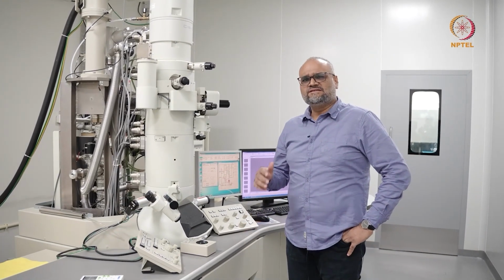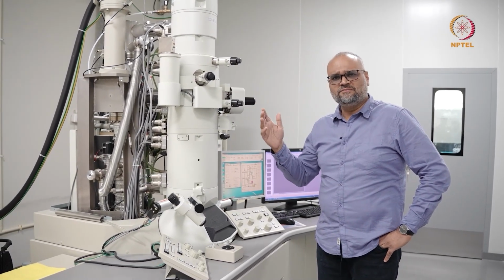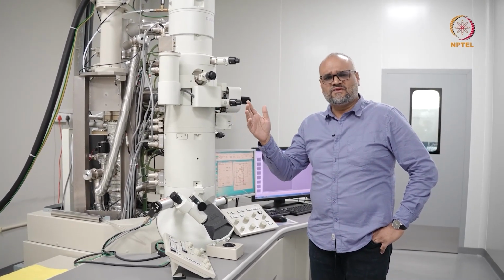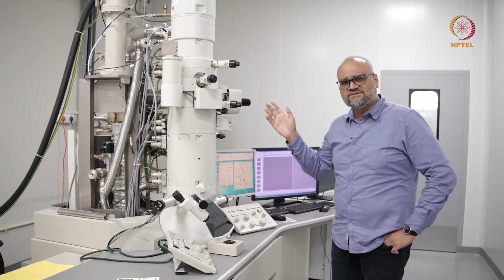So as you've seen, the general layout of any transmission electron microscope is you withdraw the power from the main line, which is either 230 volts or 110 volts, depending on where you are. And from there, if required, this instrument being from a Japanese manufacturer, we have a step-down transformer.